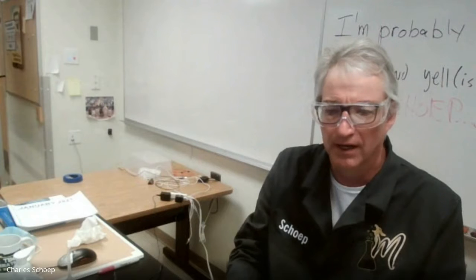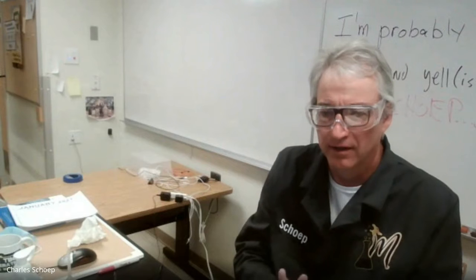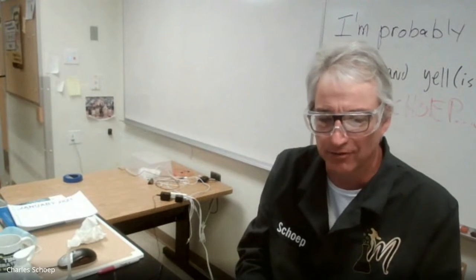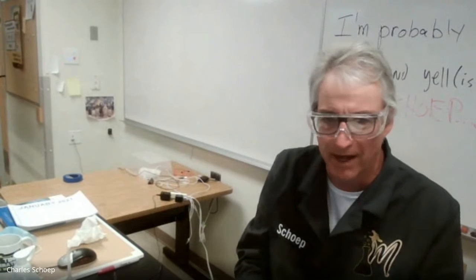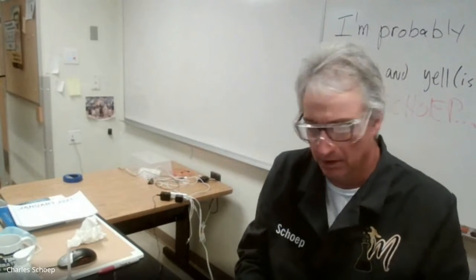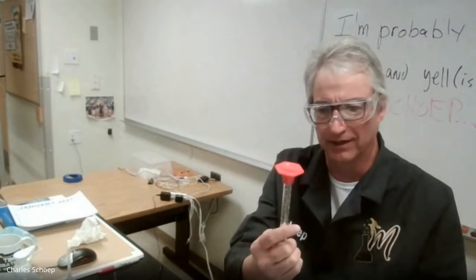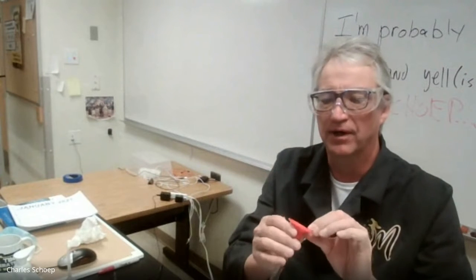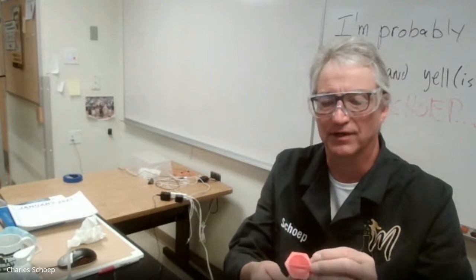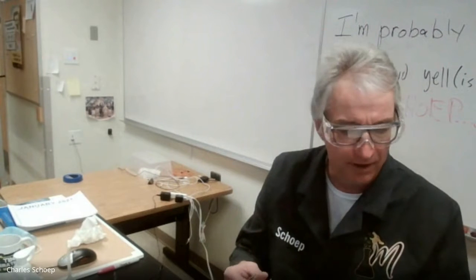An intrinsic property of matter is a property of a substance that is not going to change if you change the mass or the volume. Okay. For example, I've got the little base of my graduated cylinder here, and I bet it's red all the way through. So an intrinsic property of this piece of plastic is that it's red. All right.